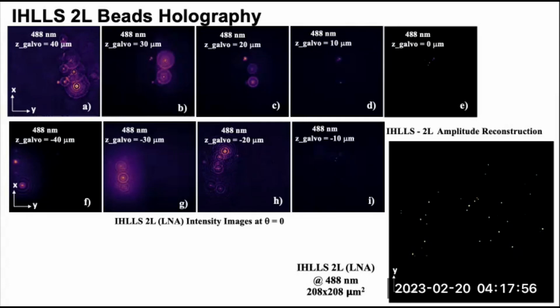The two wavefronts from the SLM interfere with each other at the camera plane to create Fresnel holograms. Four interference patterns were created using a phase shifting technique, and further combined mathematically to obtain the complex amplitude of the object point at the camera plane. The image in the right lower corner shows the max projection of all z-planes where the beads were found.